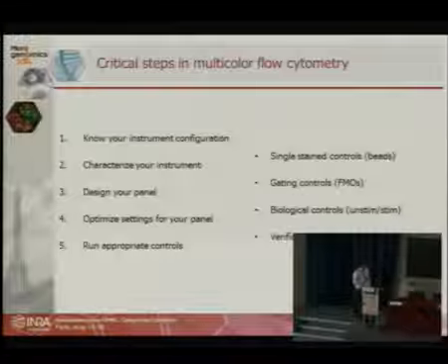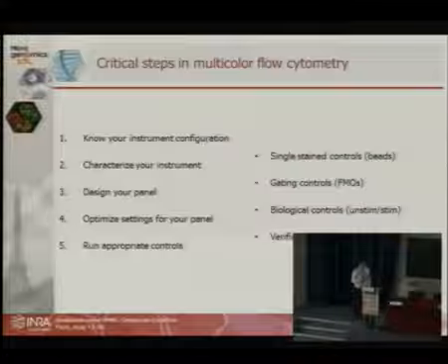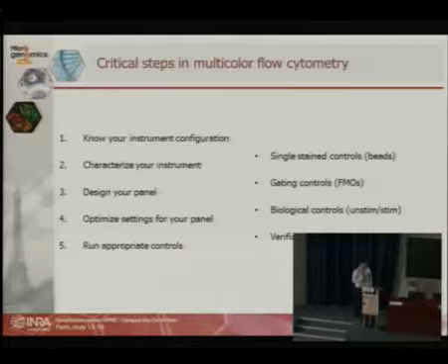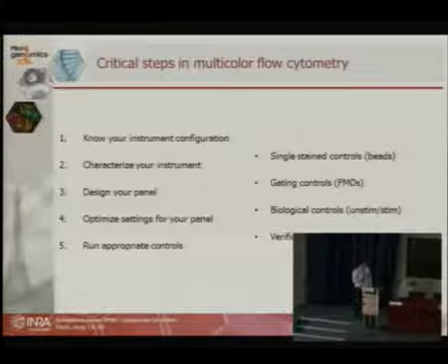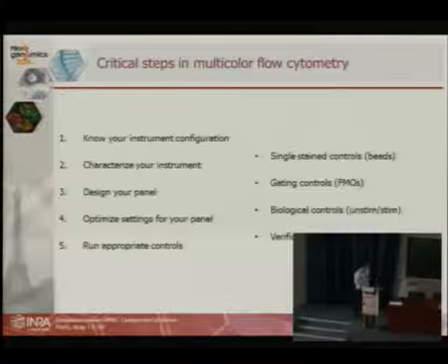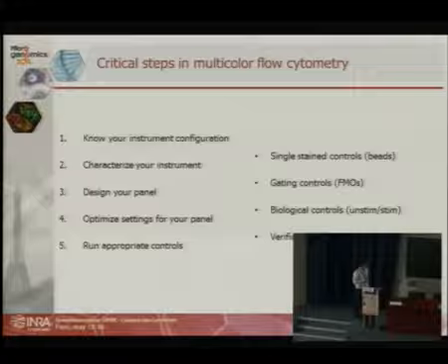And then another tool you can consider, especially for those of you that do cell sorting to purify cells for microarray studies: each time you do an experiment on a cell sorter, the sensitivity of the instrument will vary. So you have to limit the variation of the instrument because of all the implications on your panel. And you can standardize the instrument now. There are tools to do that automatically. So just be aware that it exists, and it's very powerful.